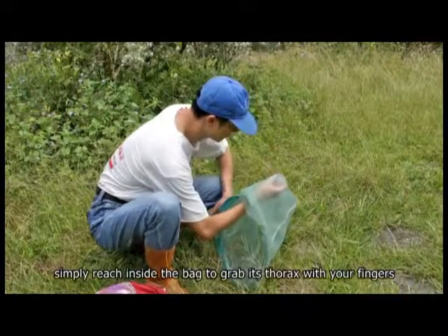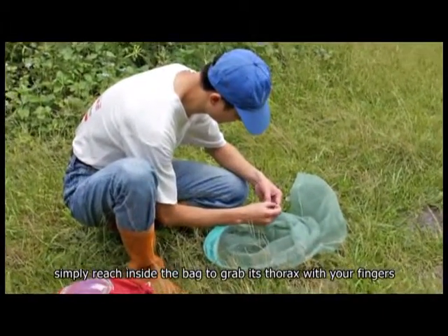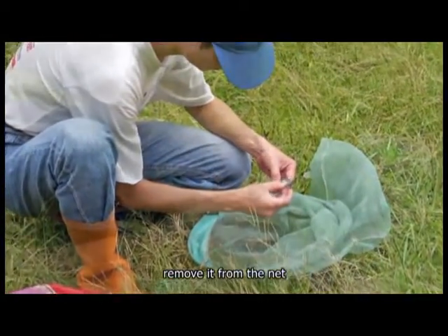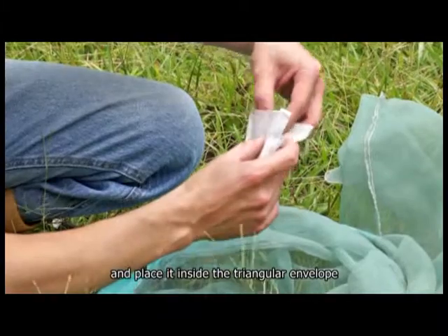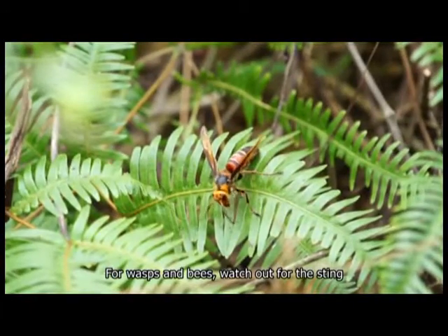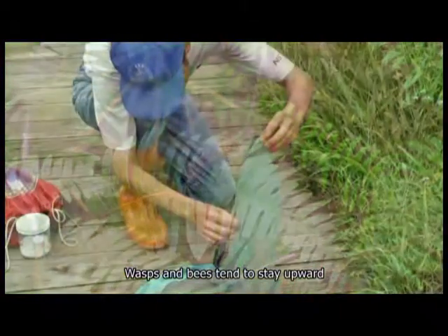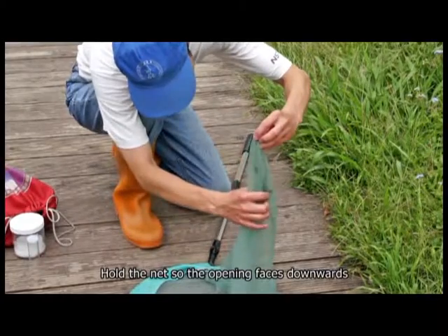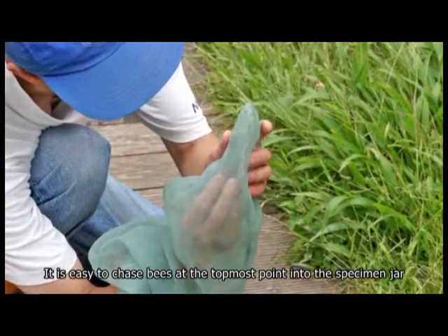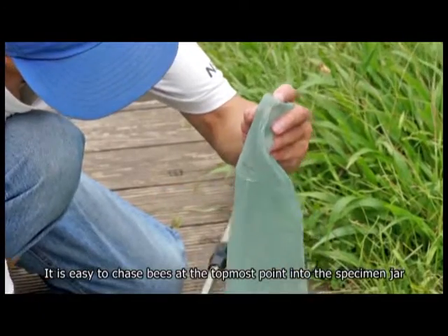For a butterfly, simply reach inside the bag to grab its thorax with your fingers, remove it from the net, and place it inside the triangular envelope. For wasps and bees, watch out for the sting. Wasps and bees tend to stay upward, so hold the net so the opening faces downwards, making it easy to chase bees at the topmost point into the specimen jar.